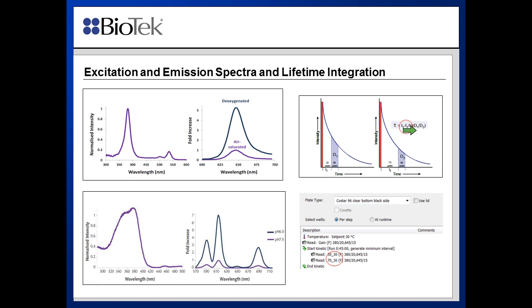The other thing I want to point out here is in the lifetime measurement. That's actually an equation that takes the ratio under the curve of the fluorescent probe, the decay of the probe, and you can measure at these 2 different time-resolved steps. We did everything at 30/70, and this is explained more in the application note. But you can also edit these. They can be 40/60. You can try 20/80, and either way, you may be able to gain some sensitivity on the assay.